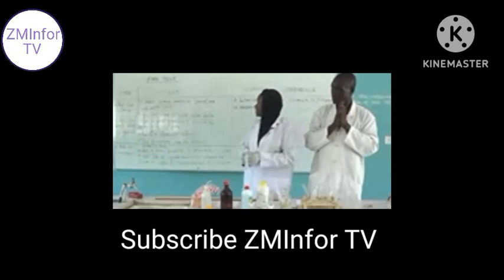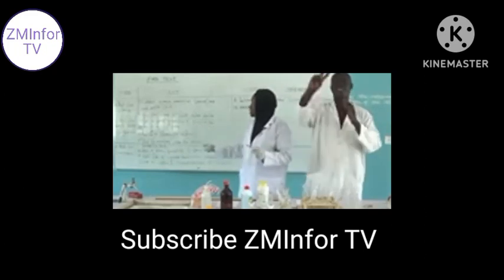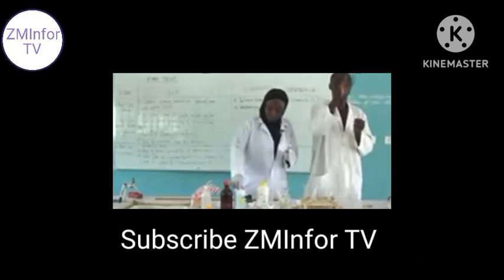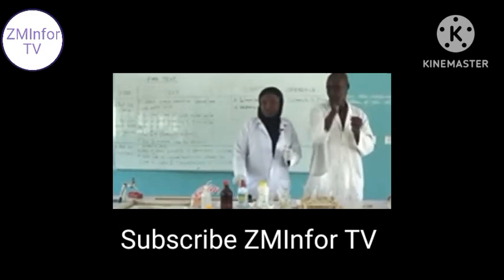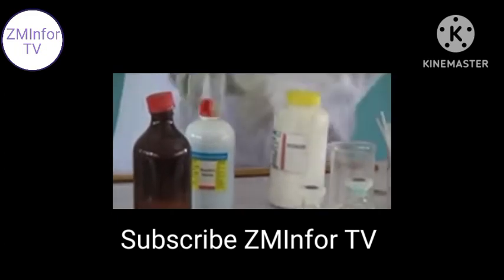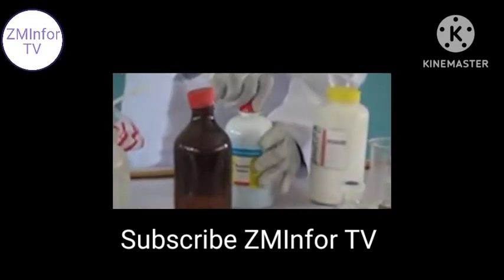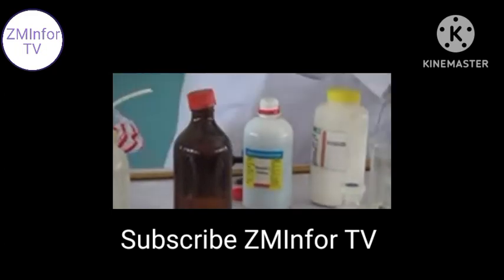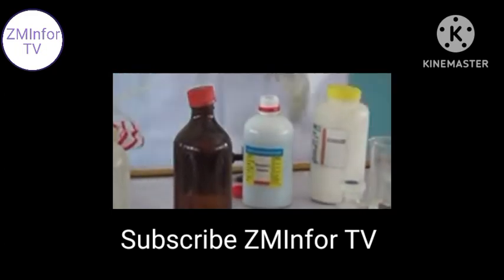And then the second instruction is that we add 2% of Benedict solution. This is Benedict solution. We still require another dropper to collect.